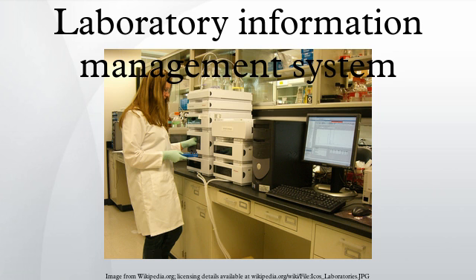LIMS. Sample management. The core function of LIMS has traditionally been the management of samples. This typically is initiated when a sample is received in the laboratory, at which point the sample will be registered in the LIMS. Some LIMS will allow the customer to place an order for a sample directly to the LIMS, at which point the sample is generated in an unreceived state. The processing could then include a step where the sample container is registered and sent to the customer for the sample to be taken and then returned to the lab.